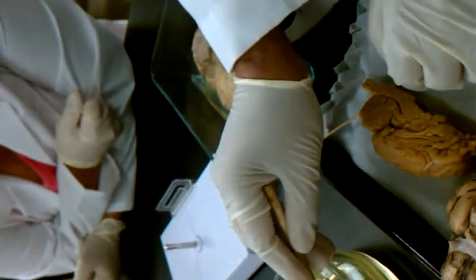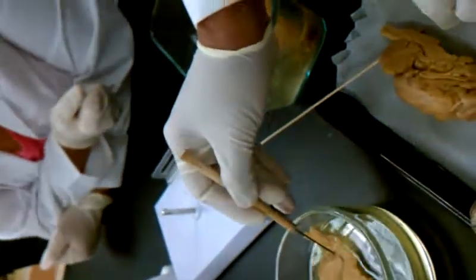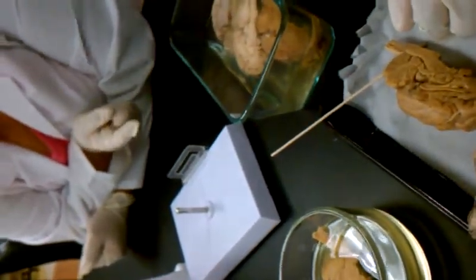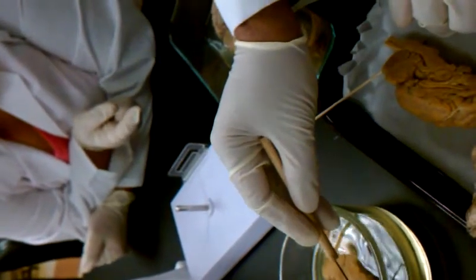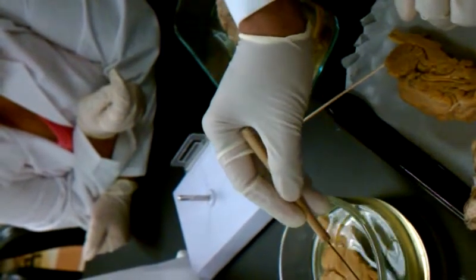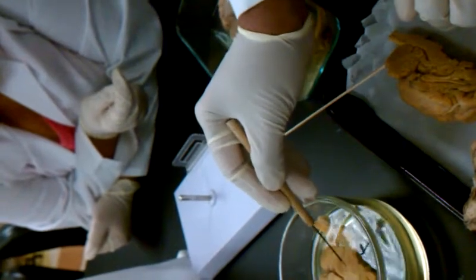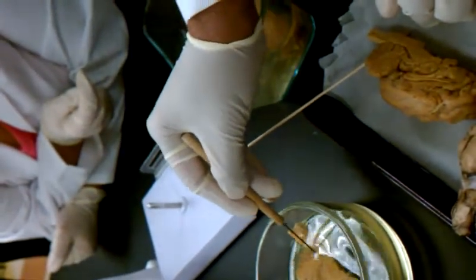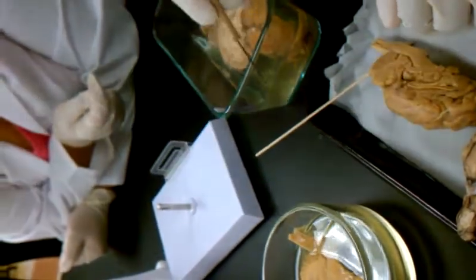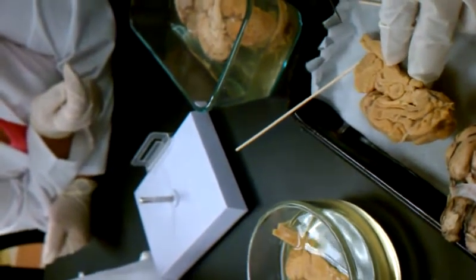Fourth ventricle is that one. The V one. Sorry, that's lateral ventricle. Fourth ventricle is down here. You have four ventricles, three types. There are two lateral ventricles on the right and left half of the brain, and this is your third ventricle. See where I'm passing the pin? Which one is the V one that you said was the second? And then it goes through the cerebral aqueduct here, and then goes to see this V-shaped cut. That's your fourth ventricle. Oh, the V one is the fourth ventricle. Yeah, right here. That's your cerebral aqueduct.